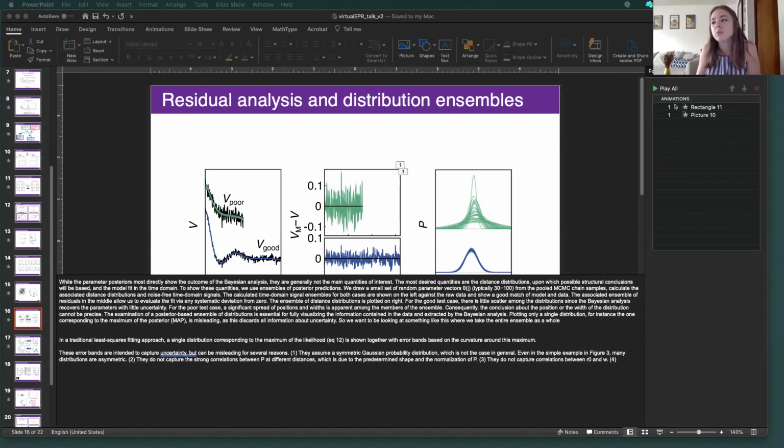Yeah, this method is nice because it just takes the raw DEER data and gets out all the uncertainty without having to make that background correction. So then you don't have to assume or look for error for a background correction because there is none. Okay, so in the examples you've given there, they're all raw data effectively? Yeah. Okay, well, very nice.